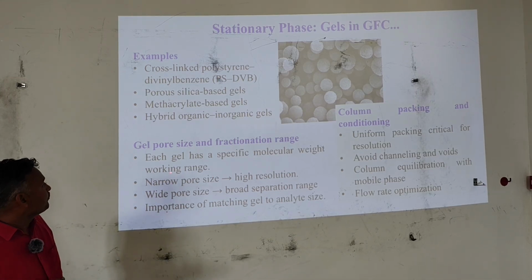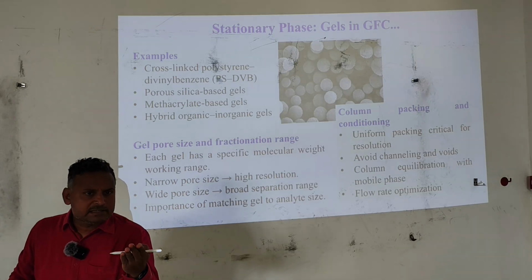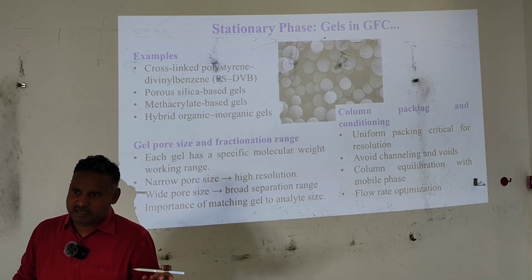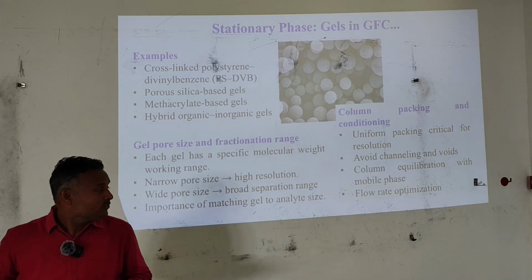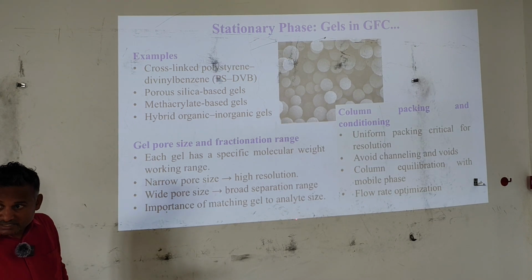As I already told you, molecular weight depends on molecular size; bigger the size, bigger the molecular weight. Narrow pore size, high resolution. Wide pore size, broad separation range. Matching gels to analyte size is very, very important, which I already explained to you.